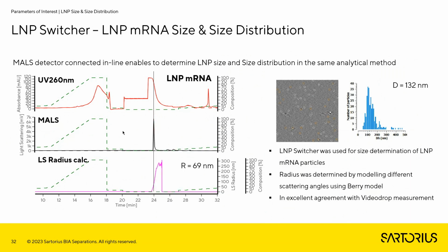The majority of particles are eluted, and their size is around 70 nanometers, and almost the same result is obtained when video drop was used for size determination of these same particles. So we can say that these results are in quite excellent agreement with video drop measurement.